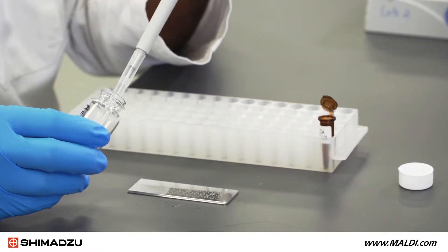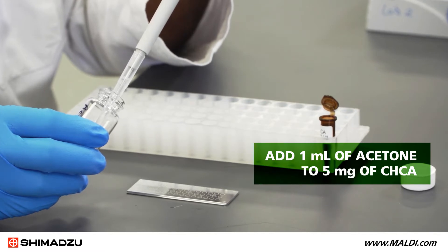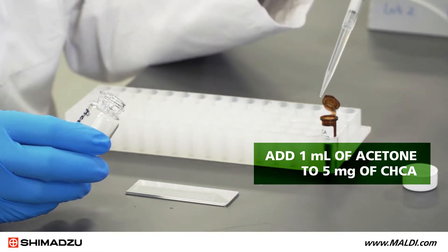To prepare matrix solution number one, add one milliliter of acetone to five milligrams of CHCA.